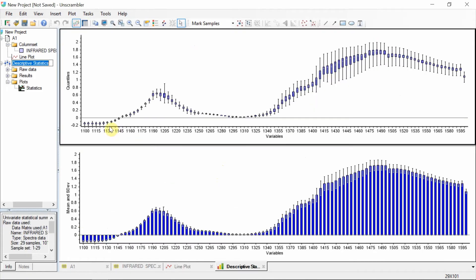Here we see box plots for each of the spectral variables. Notice towards the end of the spectra how the spread is getting wider and wider. This is indicative of scatter effects.